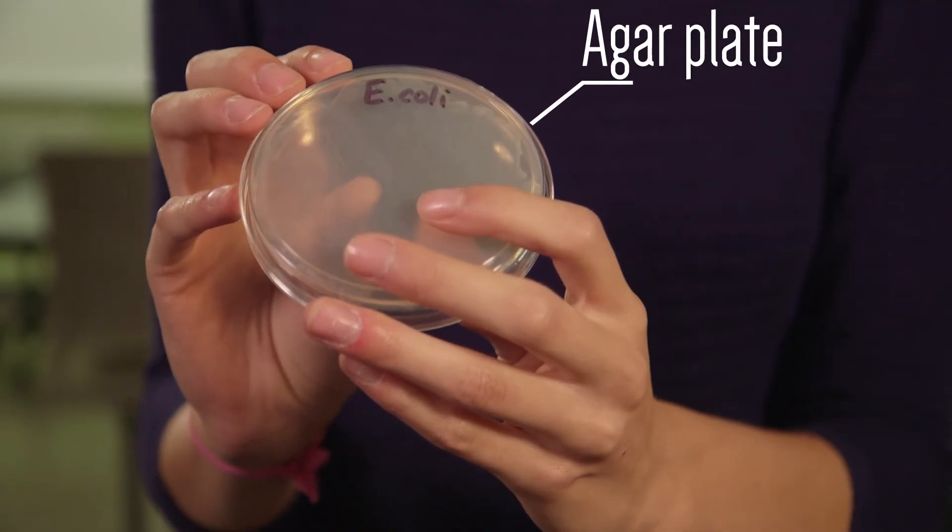Here is a petri dish containing sterile agar, commonly referred to as an agar plate. Agar is a gelatin-like substance made from seaweed. It is moist and contains nutrients, so it is an ideal environment on which bacteria can grow.